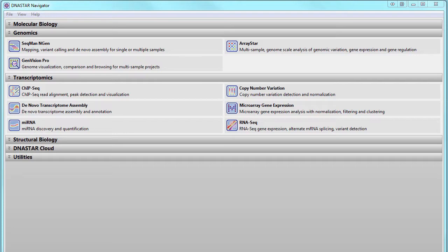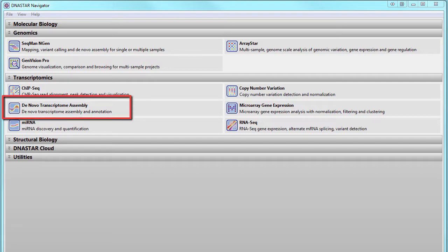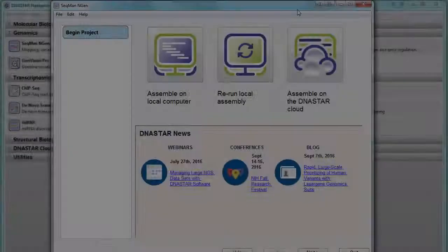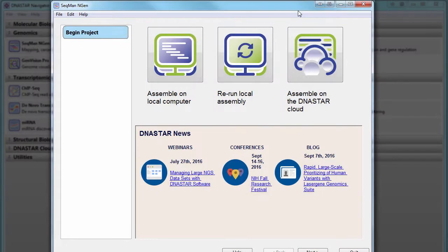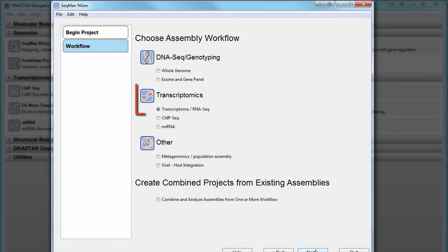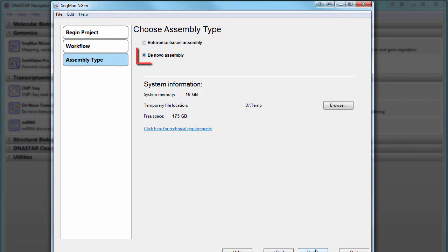To get started with DeNovo Transcriptome Assembly and Auto Annotation in LaserGene, select DeNovo Transcriptome Assembly from the DNA Star Navigator. You can also start by setting up a new assembly in SeqMan Engine, selecting Transcriptome as your workflow, and specifying DeNovo Assembly as the assembly type.